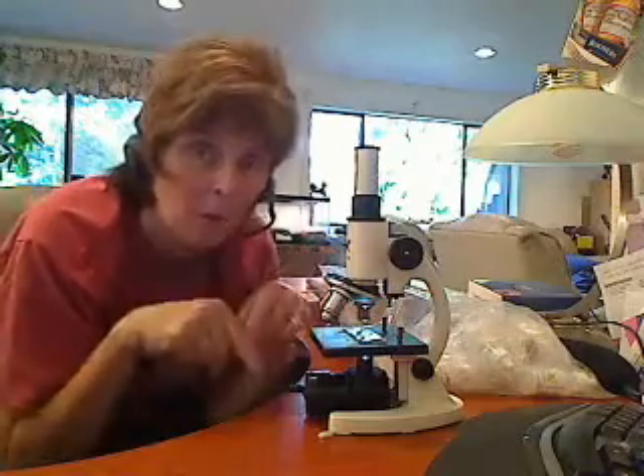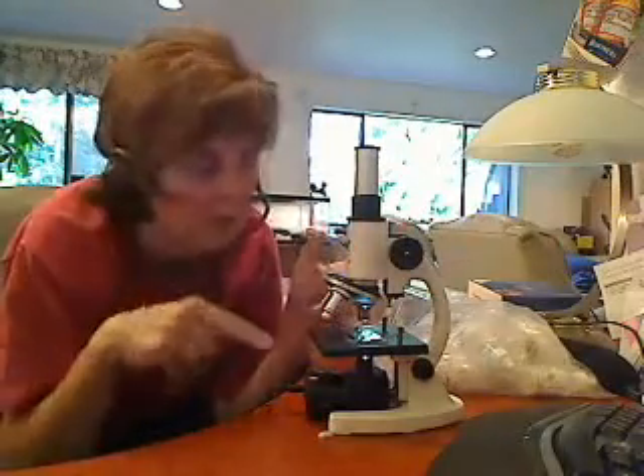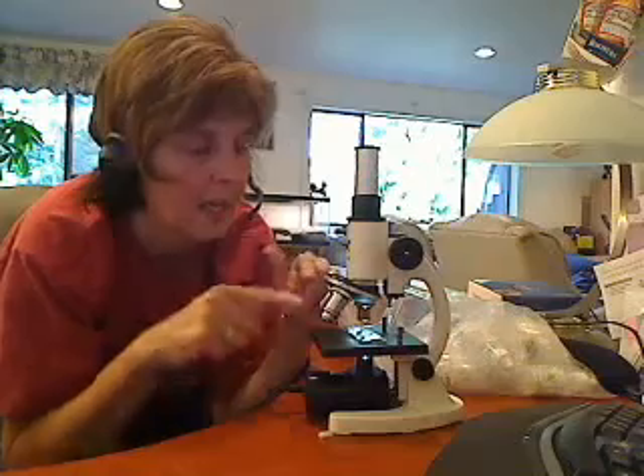I highly recommend you start on 4, then go to the 10, and then go up to the 40 to see at 400 power. Always multiply the ocular by the objective to get your magnification.